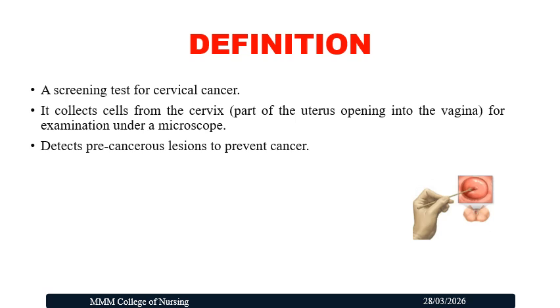Coming on to the definition. It is a screening test for cervical cancer. In this procedure, we collect the cells from the cervix for examination under the microscope. It helps to detect the precancerous lesions to prevent cervical cancer.